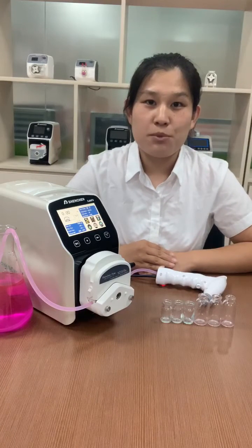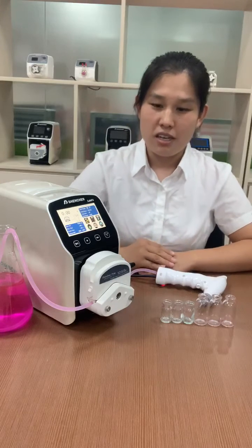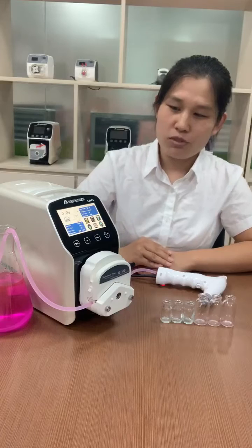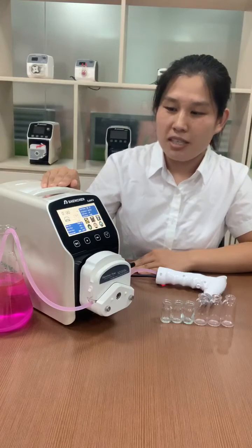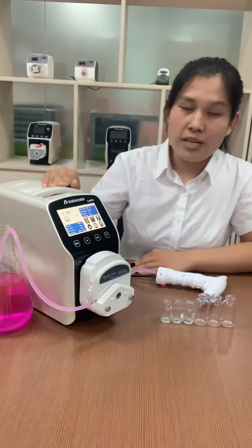Hello everyone, welcome to Shenchen Precision Pump. We are a professional manufacturer for peristaltic pumps since 2006. Now I will introduce our most popular Lab F6 dispensing pump. It is specially designed for automatic liquid dispensing.